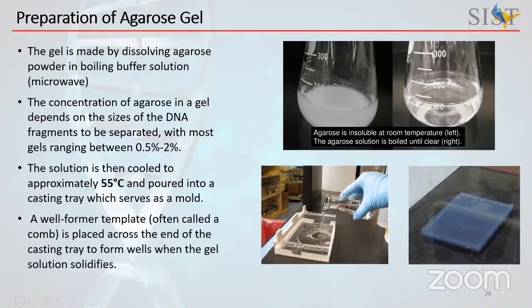All right. And then right after pouring the gel, we'll have to place a comb so that it will create wells in the agarose gel. And after the gel is solidified, we can remove the comb.